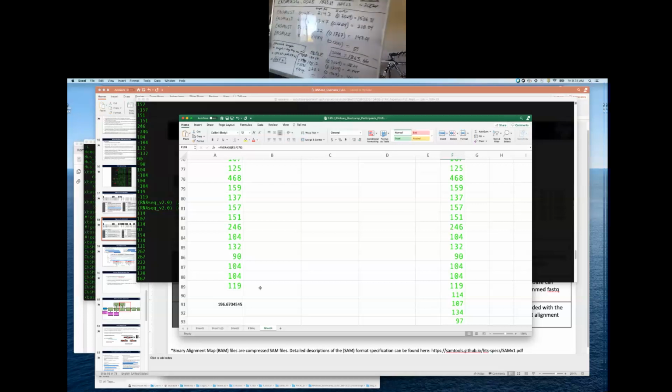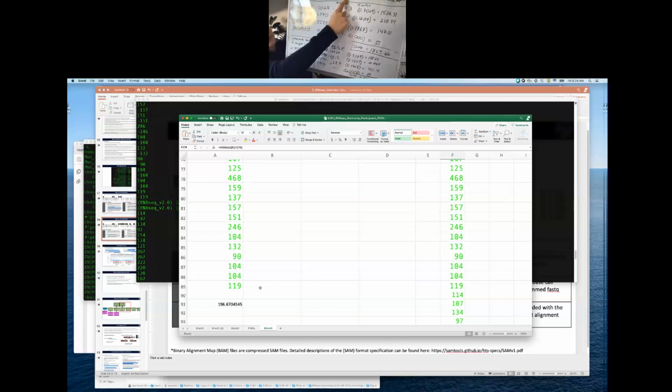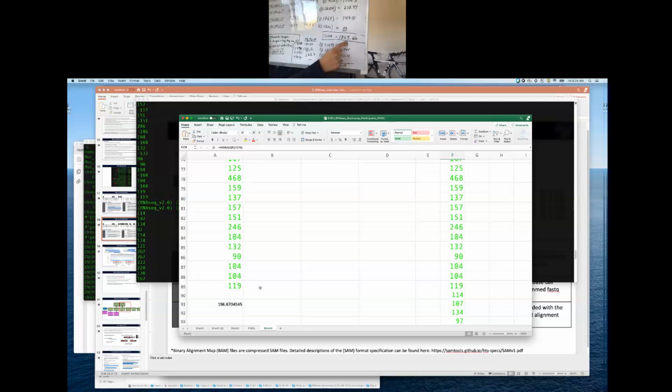And then over in this bottom corner here, using that equation that I just showed you from the author of RSEM, the effective length is going to be equal to the length of your gene, which again is weighted based on the length of each one of the transcripts. That's what we just calculated here. So that's what we just calculated down here, which matched pretty closely to here, with probably some rounding differences.